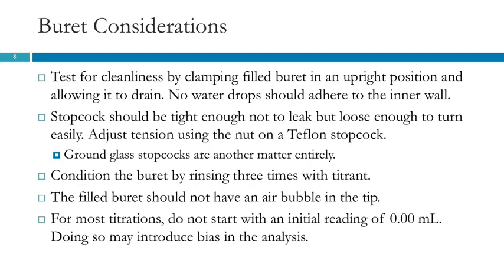And in Chem 1A, we want to make sure that liquid comes out of the burette, right? That the tip isn't all clogged up with dried sodium hydroxide. We're not going to worry about water drops. But as I'm walking around looking at the burettes, part of me is just cringing because it's wrong. It's just wrong.